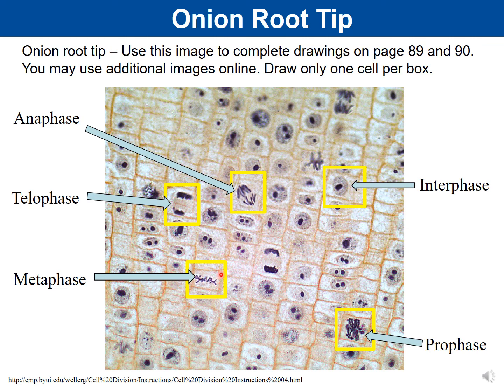Metaphase, when you look at a cell that's in metaphase, remember that metaphase means middle, right? So metaphase, middle, that is where the chromosomes line up single file along the metaphase plate. Now, one of the things that you want to think about is that while textbooks like to show it as this perfectly straight line, in actuality, that is not what it really looks like. That's because the chromosomes are held together at the centromere, so only part of the chromosome is held together. The other parts, the other arms, are free floating.